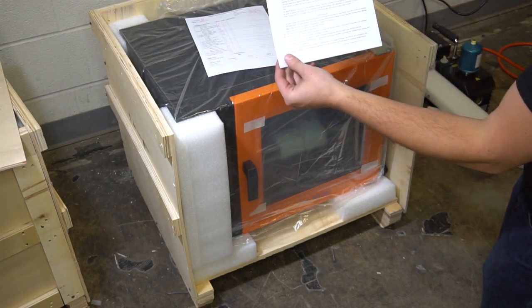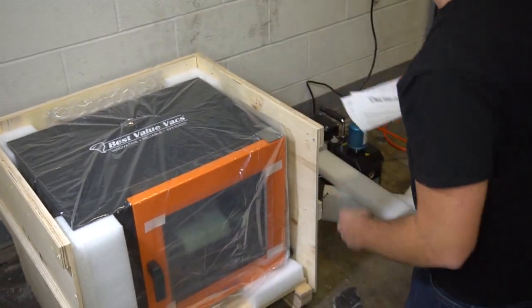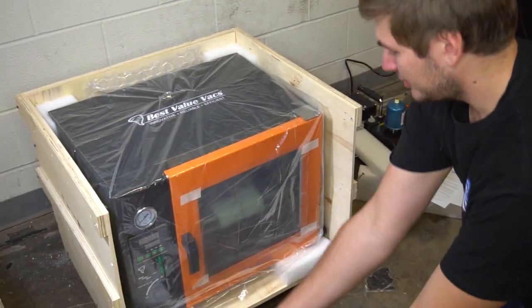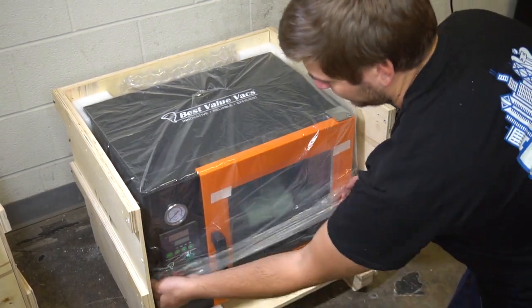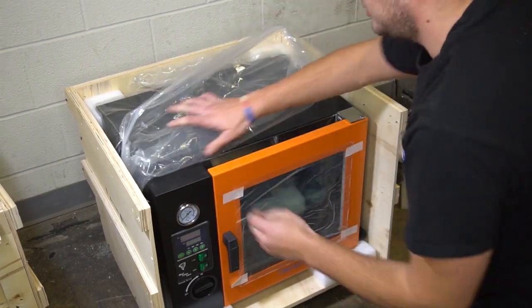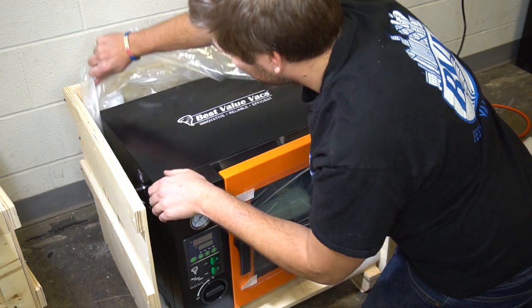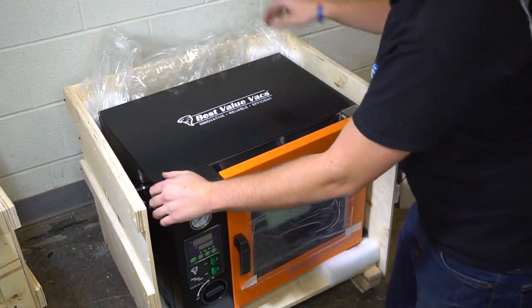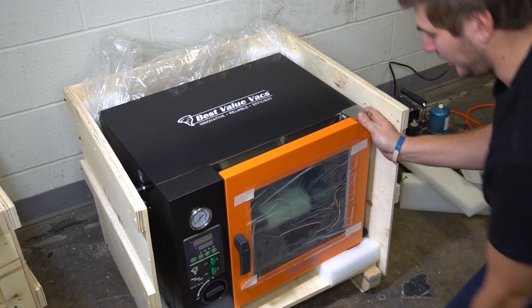Right here we have our oven quick start guide along with a quality control sheet. We'll take off this protective cover and then take this oven out of the crate so we can start getting it up and going.